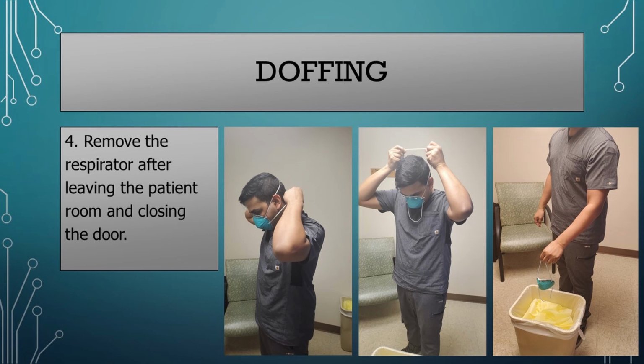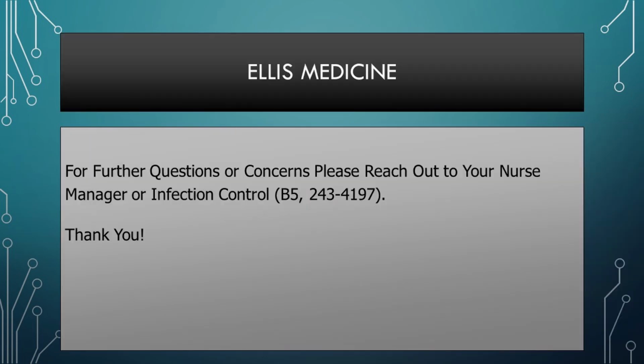Once all our personal protective equipment is doffed, we can proceed with hand hygiene. For further questions or concerns, please reach out to your nurse manager or infection control.